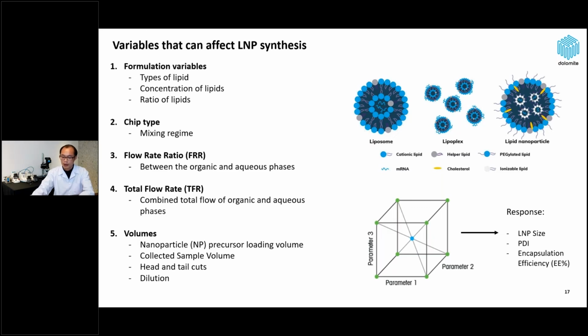Sorry, there's something wrong with the audio connection, so I will try to solve it. All the variables will respond in three points in the results: lipid nanoparticle size, monodispersity, which we see in the polydispersity index, PDI numbers, and the encapsulation efficiencies.